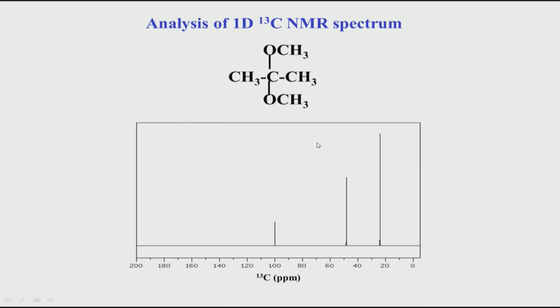Similar to what we saw in the proton, where we counted a group of peaks, let us say we call the multiplet structure one bunch, by looking at the bunches of peaks we could find out the number of types of hydrogens or protons. Similarly, here by counting the number of peaks, we can find out how many types of carbon there are, but we will see this rule does not always hold true, because sometimes some peaks are missing, sometimes the OH peaks are broad.